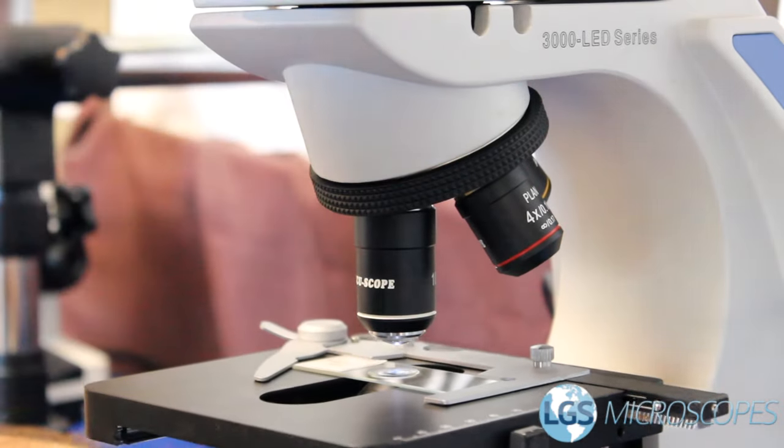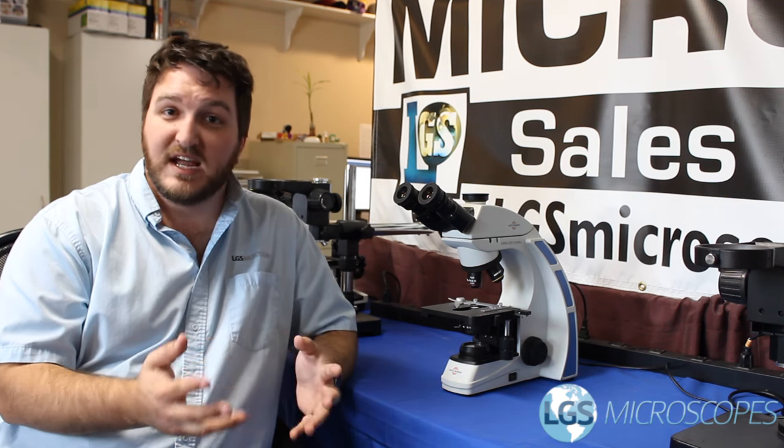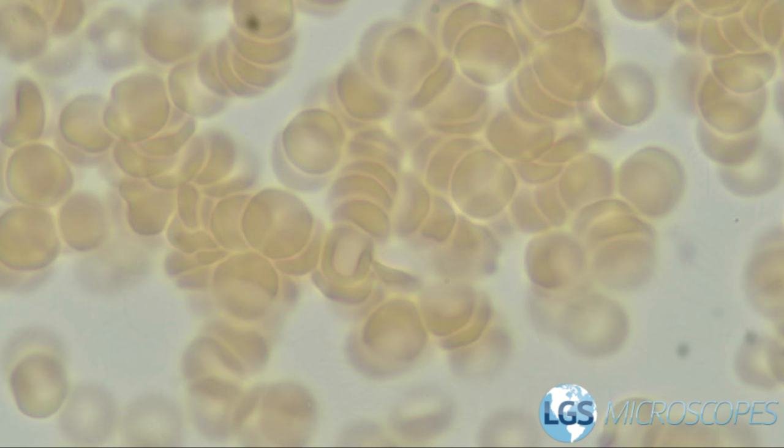The number one indicator that your objective might have oil on it or inside of it is that the image will appear hazy and kind of blurred like you can't quite get it into focus. If that happens then you should probably call a professional to take a look at it.